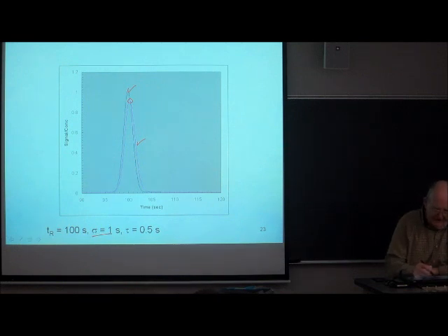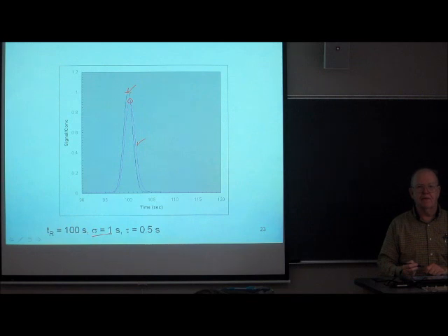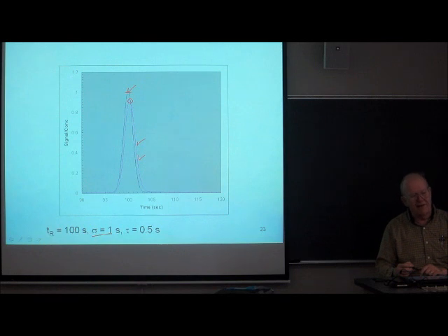It's less than that. And this peak is shifted. It's at a slightly longer time than the underlying Gaussian. And in fact, it's a little tiny bit asymmetric.